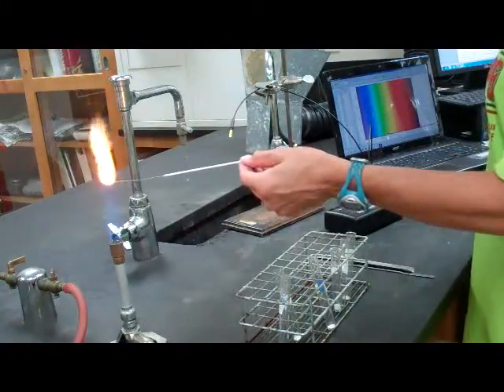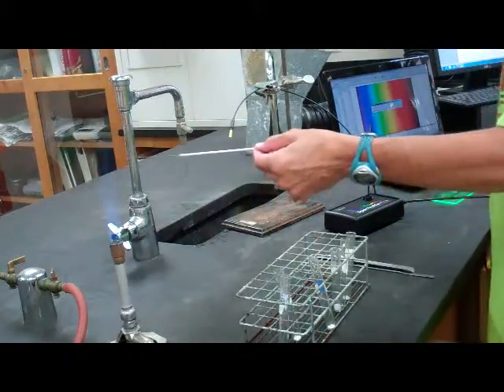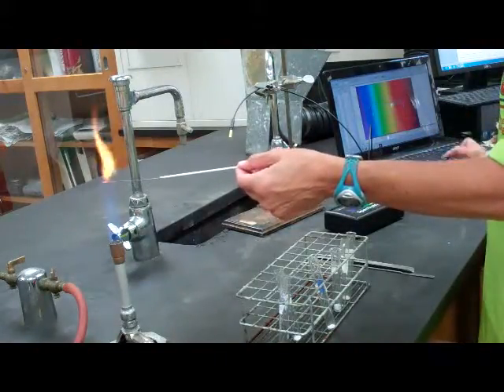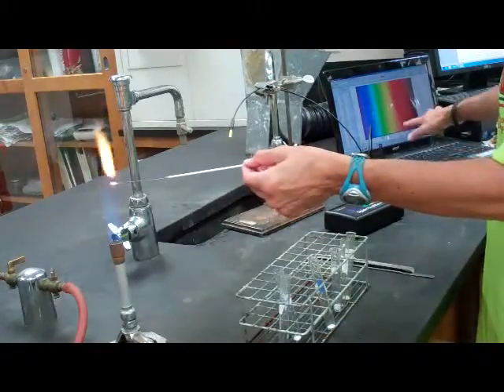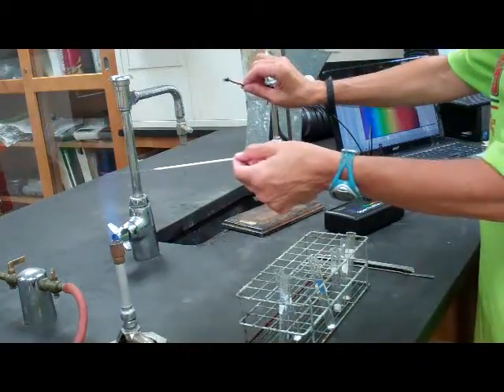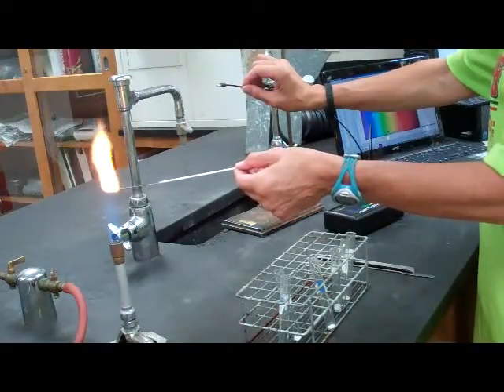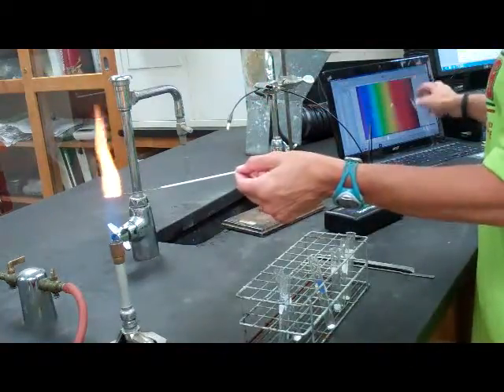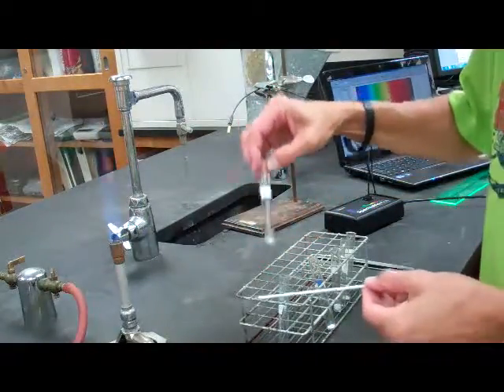And I definitely get a color change. I'm going to hit collect. And we want to store the latest run when the option comes up on the computer. Store latest run. And we are definitely getting a color change with our fiber optic cable in a slightly different area of the flame. We're seeing bumps, or peaks, is what we have. So again, this is a different one. This was our sodium.